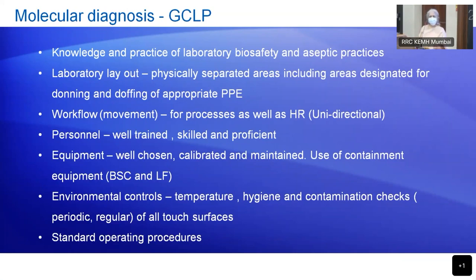So these two sets of laboratory staff should be separate. They can work on different days at different times, but they can never run from the dirty lab to the clean lab. This is true even for the consumables that you want to transfer. Each lab should have its own set of equipment and its own set of consumables. As far as possible, nothing should be shared between the clean area and the contaminated area.